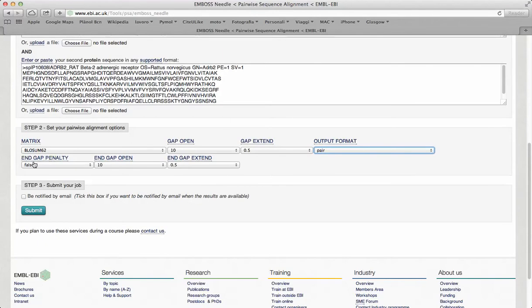We will maintain these default options in the alignment. The last step is to submit the job.